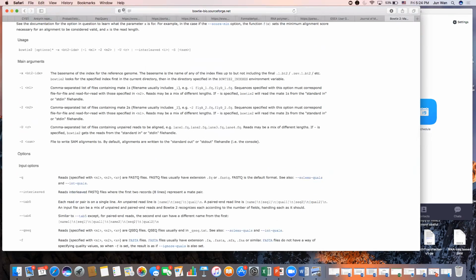You do not. This is why I recommend making that subdirectory and calling it BT2 index or whatever name you like. Don't use the names I use. Use the names that mean something to you. I'm a really simple, straightforward person. I call it Bowtie 2 index. Put that zip file in there, unzip it, and you have all 6 files right in there in your path. So your present working directory where that's at, whether it's the n/cars/whatever, or if it's gpfs/home/ however your directory is laid out. At the end of it, you'll put your BT2-index.